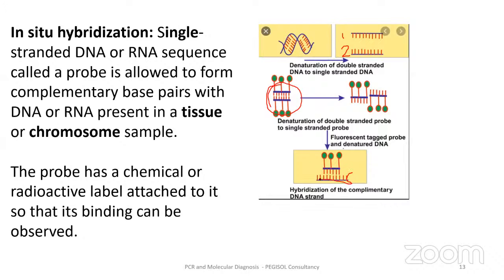So you see what happened. This is our DNA. This is our probe. And the 2 of them have bound together, just like when you hold your 2 fingers to clip them together. This is what happened there. So because this probe has found a complementary DNA and they banded together, this banding together is what you call hybridization of a complementary DNA strand.